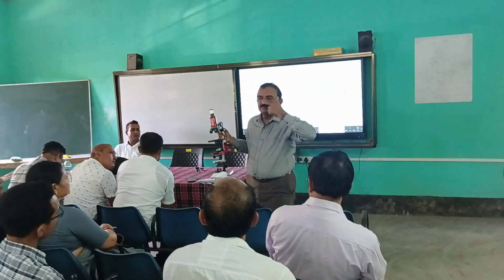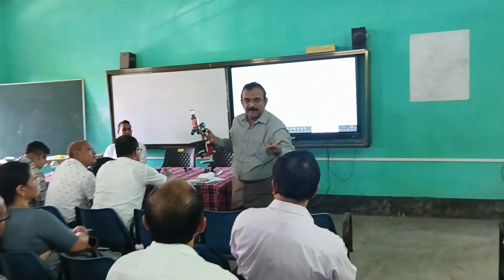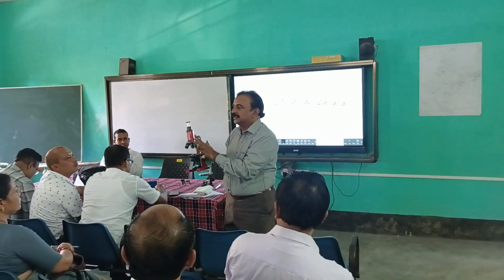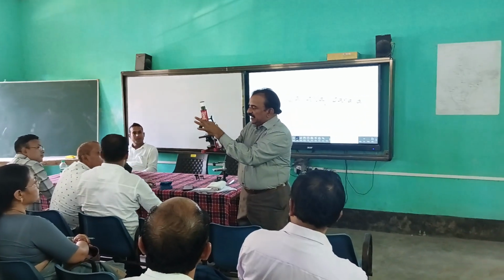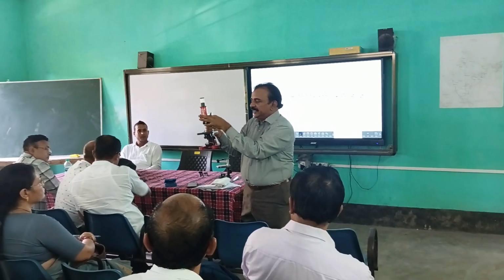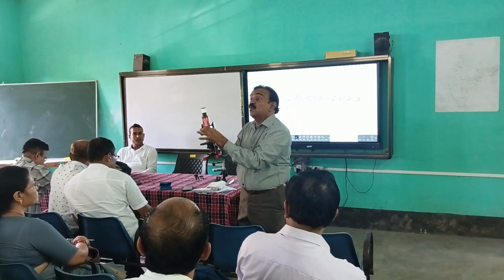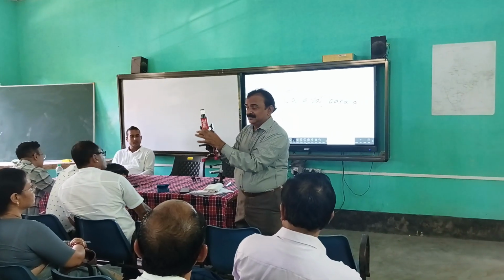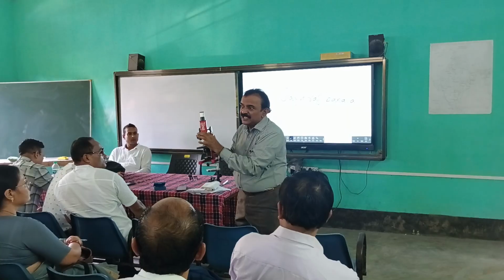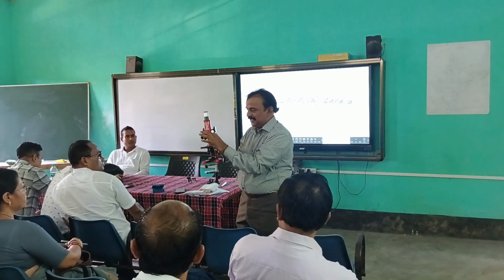Next you are observing another one. What is this one? What do we call it in our language? This is also its nose. So this is called the revolving nose. Here it is moving, so that is the reason it is called a revolving nose piece. Come on, say revolving nose piece.